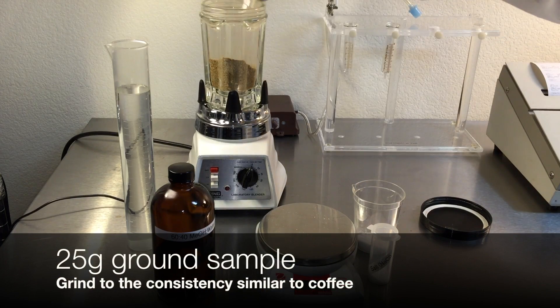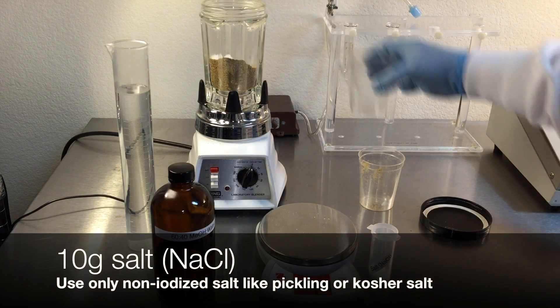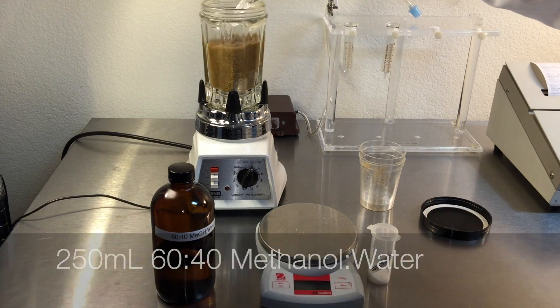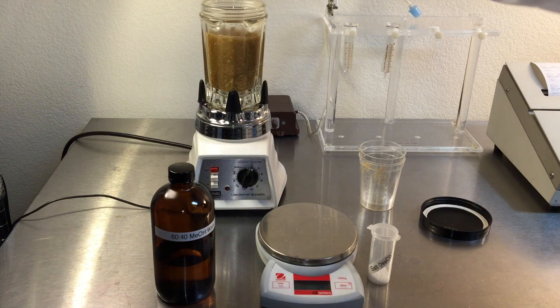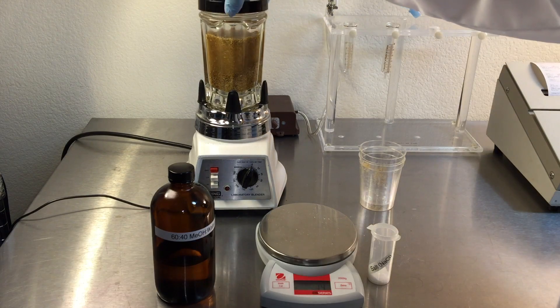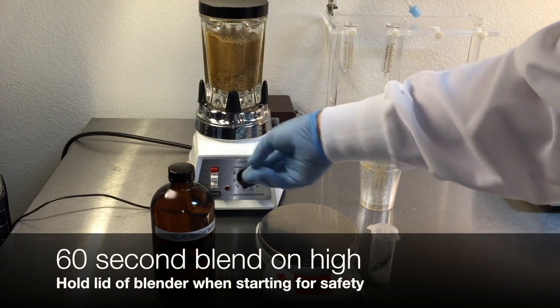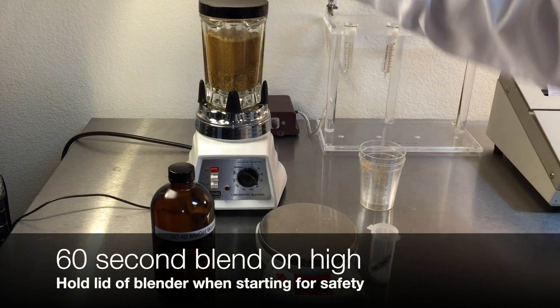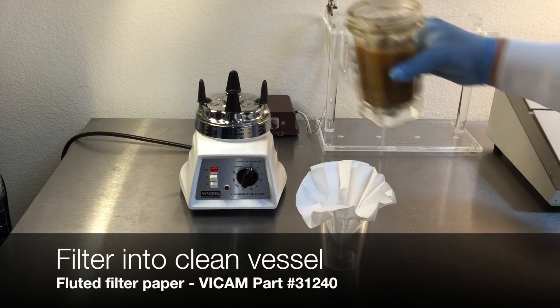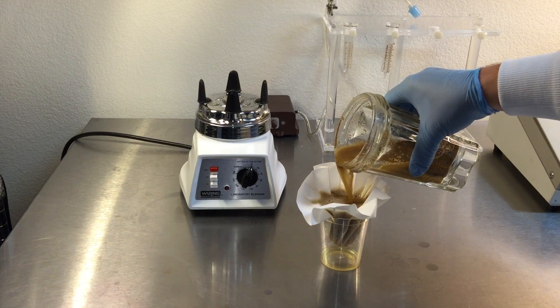Weigh 25 grams of ground sample and combine with 10 grams of salt. Place in the blender jar and add 250 milliliters of 60-40 methanol in water. Cover the blender jar and blend at high speed for one minute. Remove the cover and pour the extract into fluted filter paper, collecting the filtrate in a clean vessel.